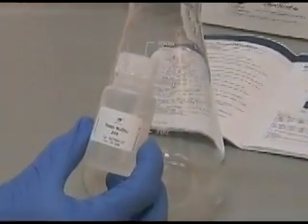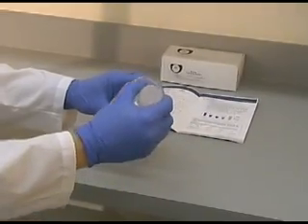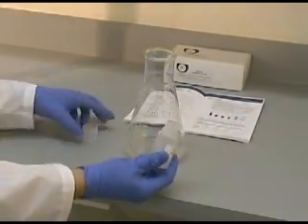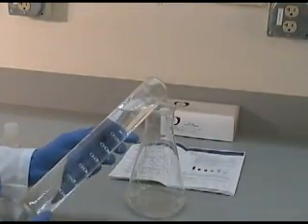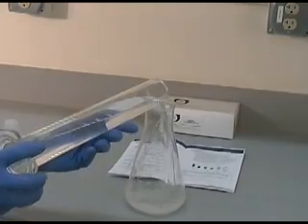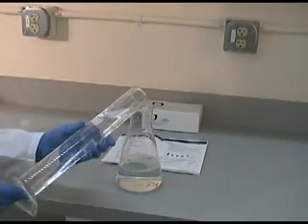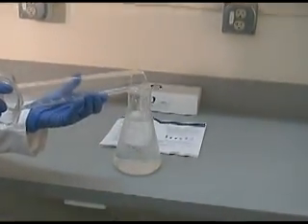First, prepare the wash buffer. Pour the contents of the 20x wash buffer solution into a clean, sterile 1 liter flask or bottle. Bring up to 1 liter with deionized water. Pouring the water into the flask is sufficient enough mixing.